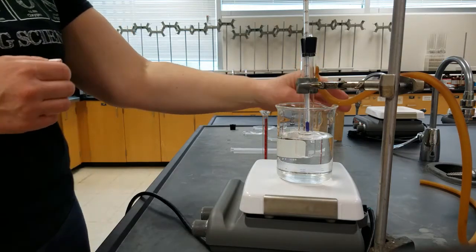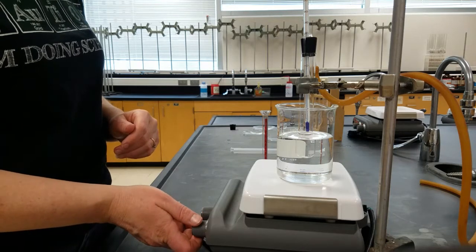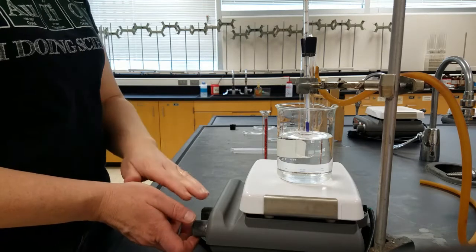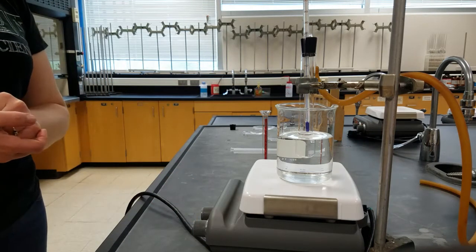We want to be careful that our rubber tube does not touch our hot plate because the tube is made out of material that can melt. We're going to turn this on and wait for our unknown to boil.